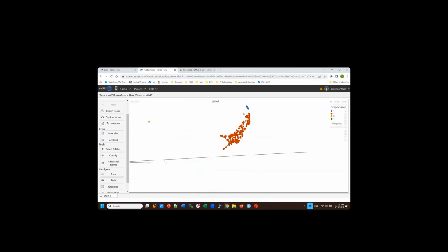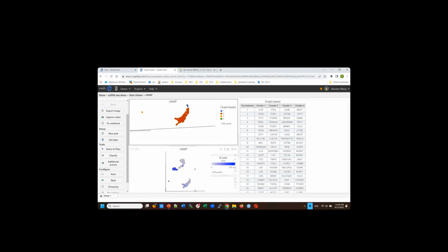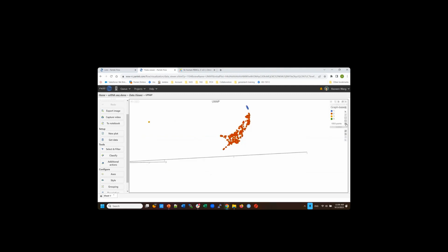Suppose I really want to, based on statistics, it said it's one cluster. Based on visualization, I think it's one cluster. And earlier I looked at my marker genes, I think this is a monocyte. So you want to make a decision here. You can use one of the selection tools. This is the paint. You can define the paint size as you go along, and that will select. I think this is very useful when you do transcriptome, using your histology information. Or you can choose this lasso and just manually lasso it.